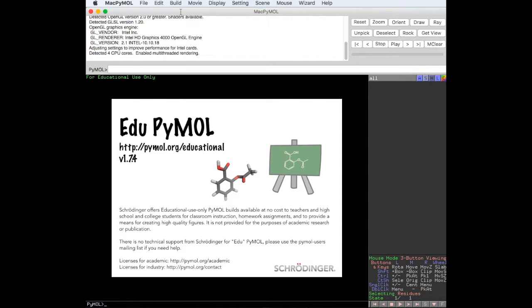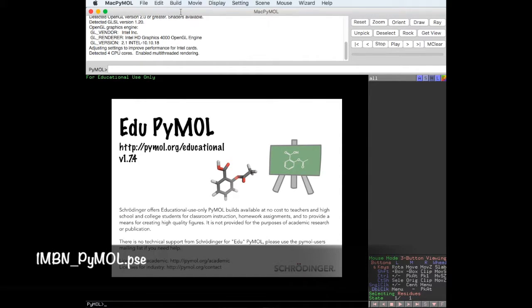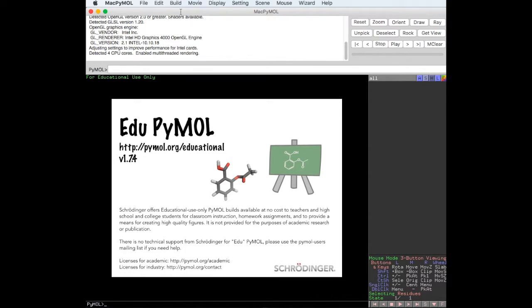Don't forget to download the file 1mbn_pymol.pse to follow along. If you are done downloading the file, let's begin. The directions in this video should work for both MacBook and PC. The program is already open on my computer. We'll begin by opening a file.